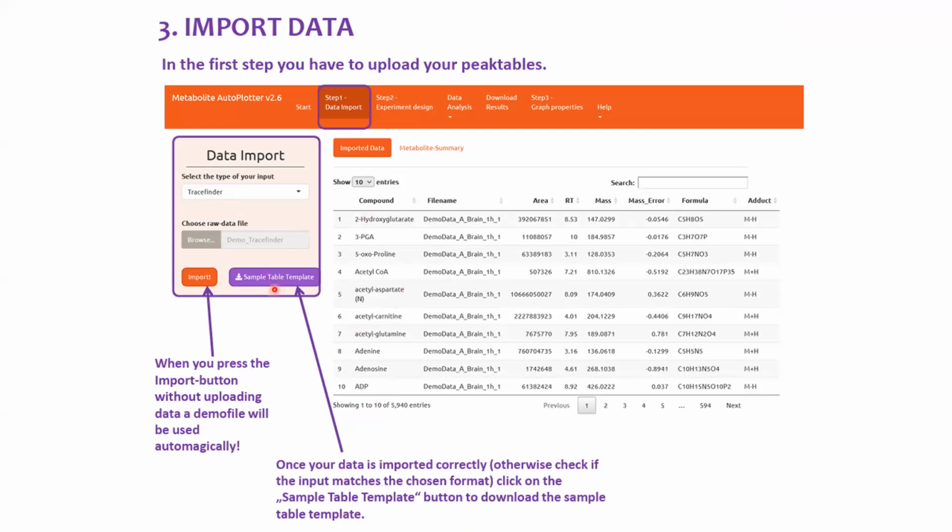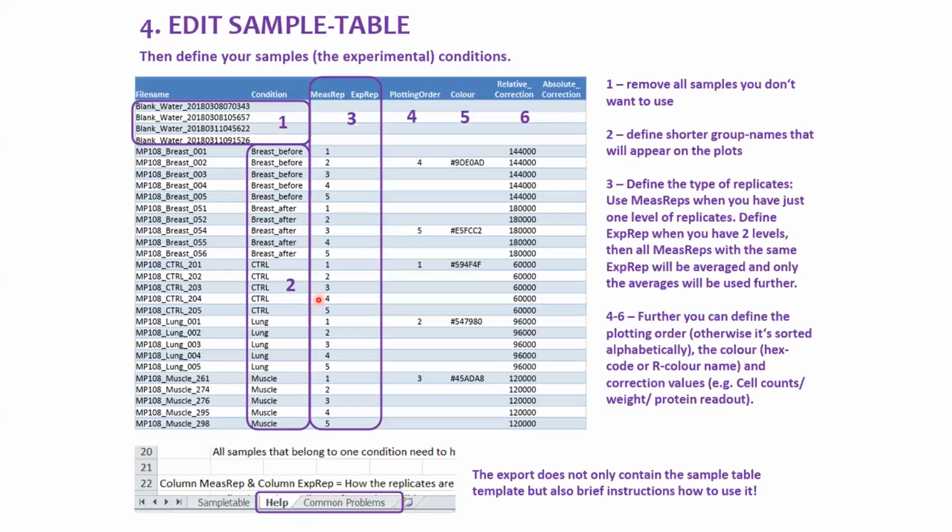You can download it, then arrange it according to the instructions the software package gives you, which is very important. I will do a demonstration of it using one of our data sets, which we collected after an experiment that we did. Here is just part of this sample table, where you can see the file name.